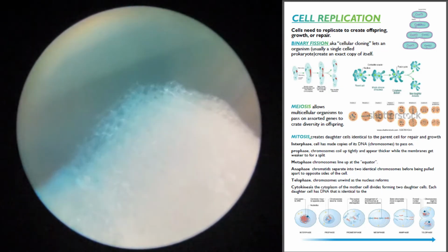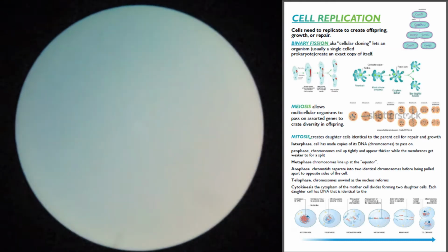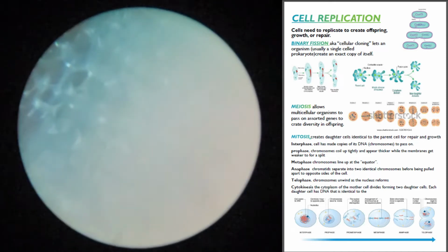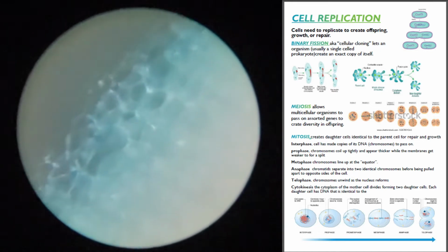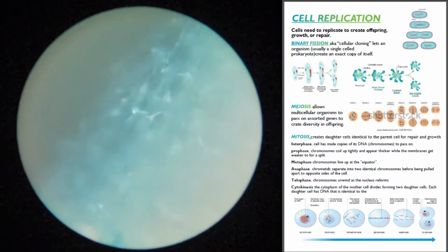So that's really what my camera is looking at right here. Boop. Right there. Flip it one more time. Alright, remember, when you push on it, push the opposite direction unless you're going up and down. There we are. Come to focus. So cool.